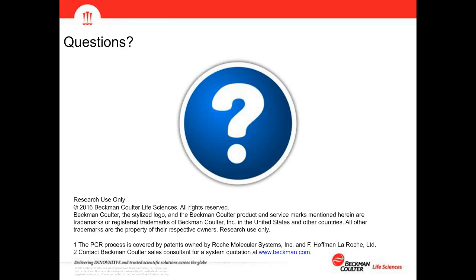That's a very good question. Absolutely. Besides everything that I've presented today, there is the fundament of very accurate pipetting that every liquid handling system needs to provide that's used to automate processes and generate reliable data. The way we handle that in Biomek software is we have something we call pipetting templates.